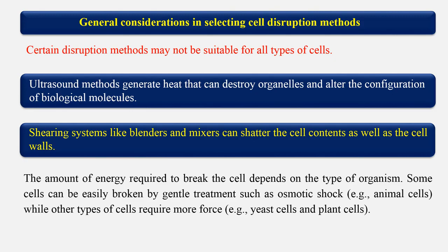For example, the ultrasound method generates heat that can destroy organelles and alter the configuration of biological molecules.